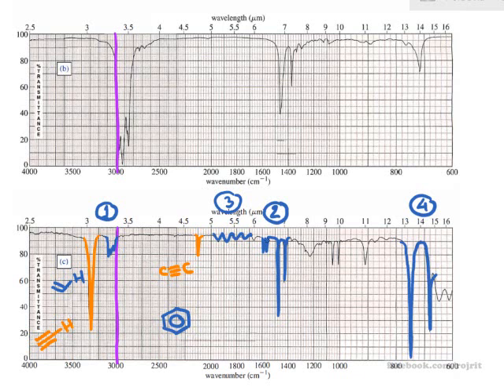So you may see only some weak absorption, and that gives you less certainty about the structure. But if you can clearly see all four here, you can be sure that this is a benzene, right? So this compound is very small. You have just the terminal alkyne and the benzene, nothing else, so you can clearly see these 4 characteristics of the benzene in the IR spectrum.